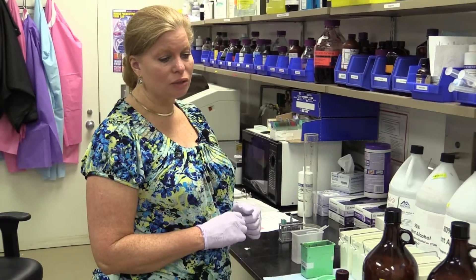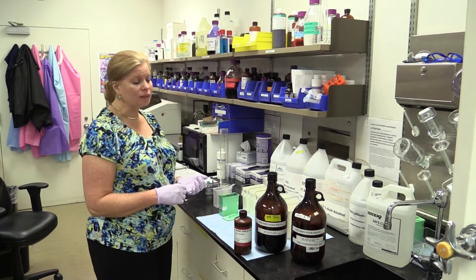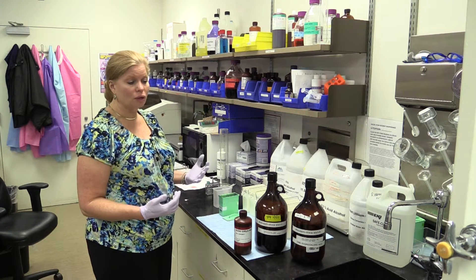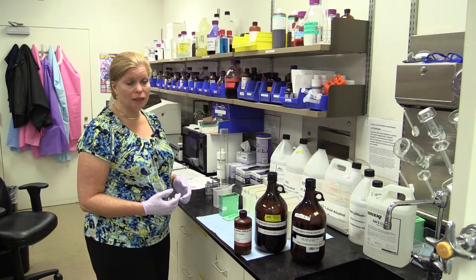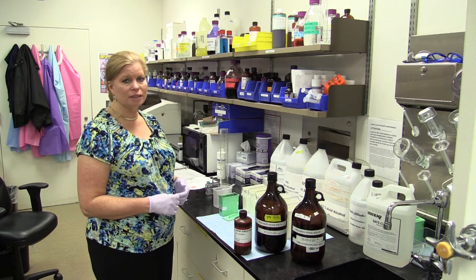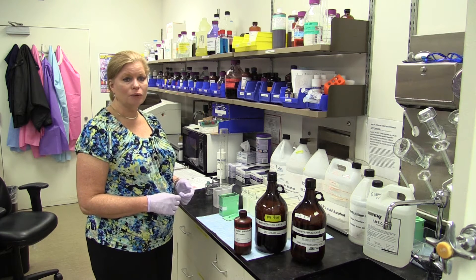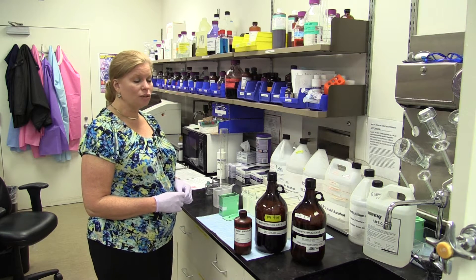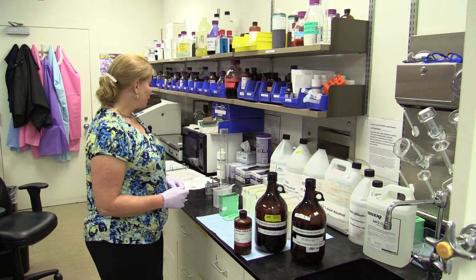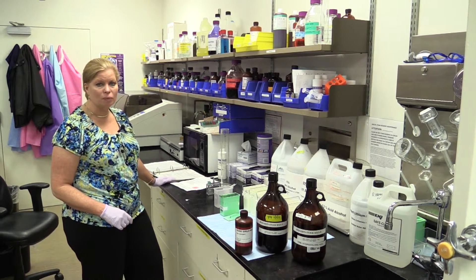Type 1, 2, and 3 collagen are going to birefringe a little bit differently with this stain. Under light microscopy it's going to show all collagen red and all the background staining yellow. Under birefringent it's going to show distinct differences when it polarizes between the different collagens by color — some green, some orange, and some brighter orange-red to distinguish the different types of collagen. You can read up more on that in John Kiernan's histology book.